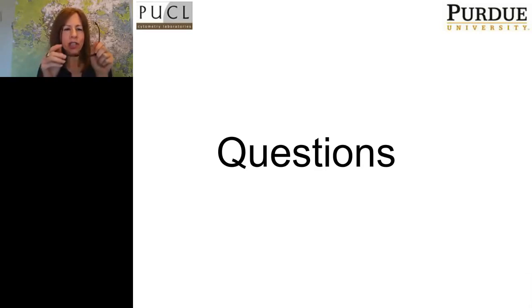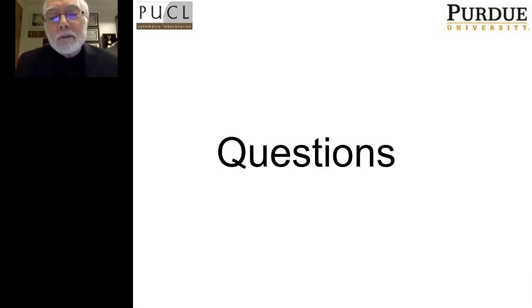Our first question is, what has changed with APDs that has allowed them to work with flow cytometry? The question is what has changed with APDs that allows them to work with flow cytometry. This is a great question.